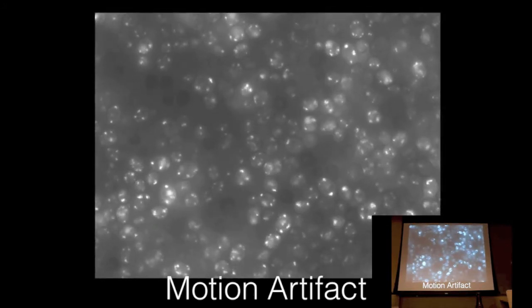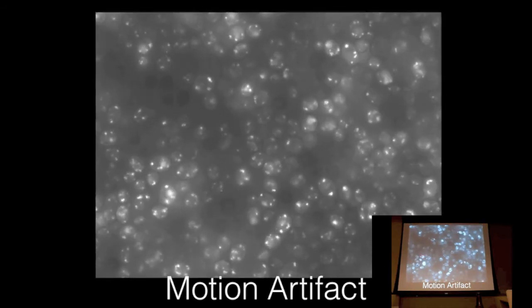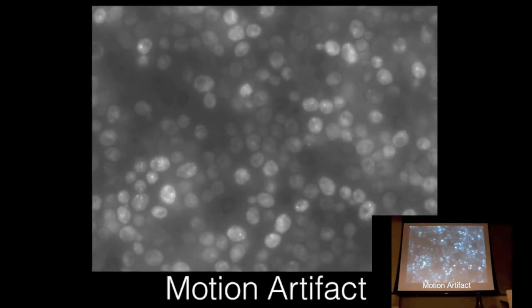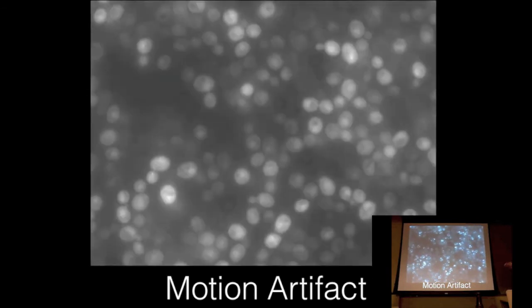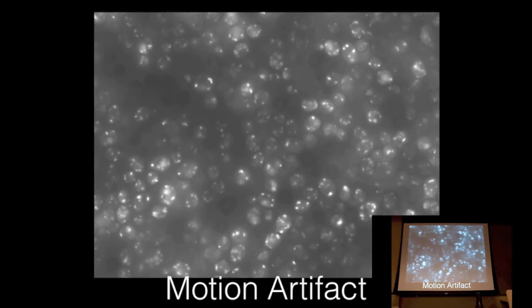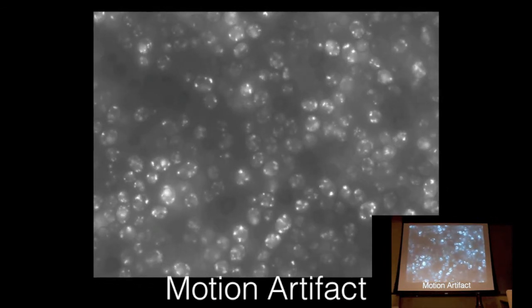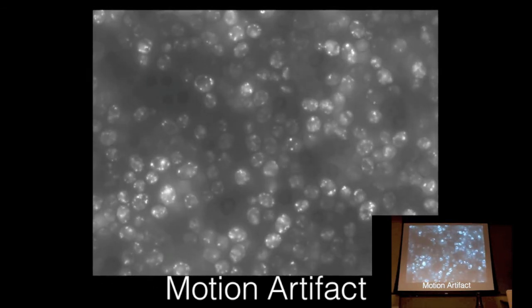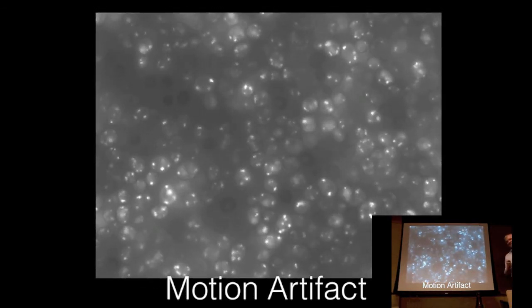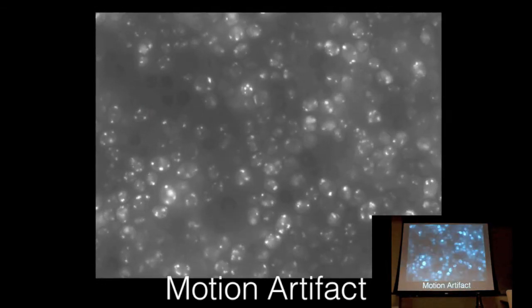And the better way to deal with this kind of problem, if you really cared about those first few frames where it was out of focus, is to do a better experiment, to try to figure out a way to get the sample in thermal equilibrium before you start taking the movie. I didn't mean that as mean as it sounded. Nobody likes it when the analysis guy comes in all big and tells the experimentalists what to do. No, but the point is to warm it up first.